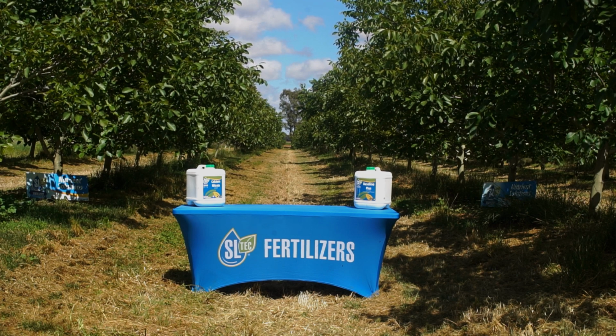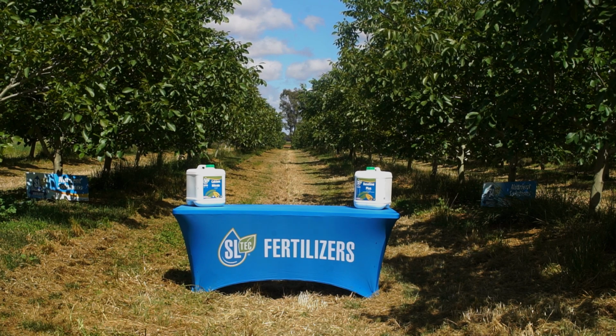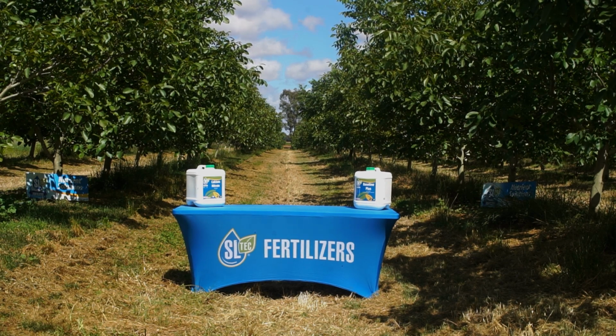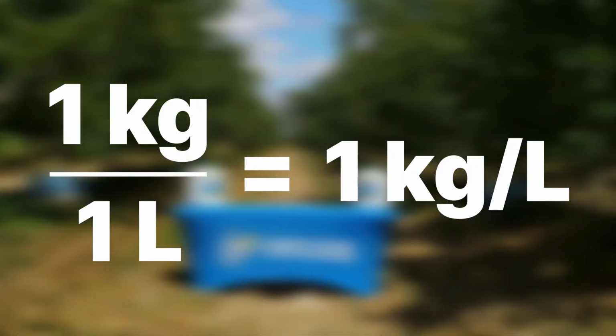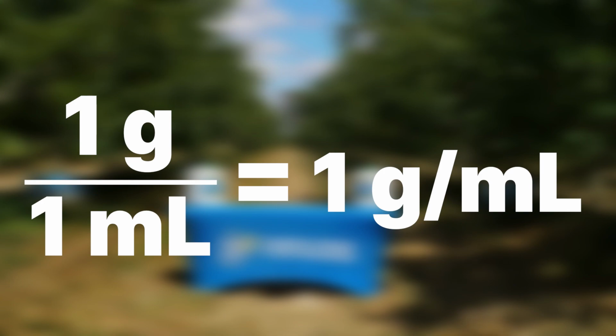Today, we'll be discussing specific gravity of liquids and how you can use specific gravity in your on-farm quality control processes. Density is a measurement of a liquid's weight per unit of volume. For example, water's density is 1 kilogram per litre, or 1 gram per mil.